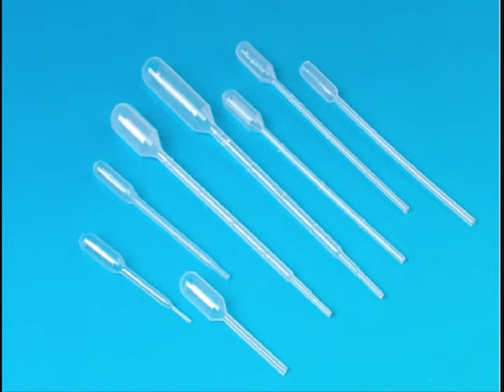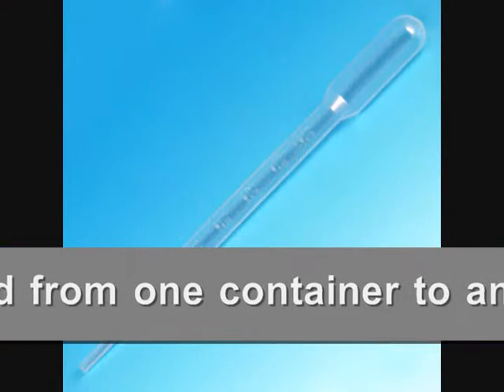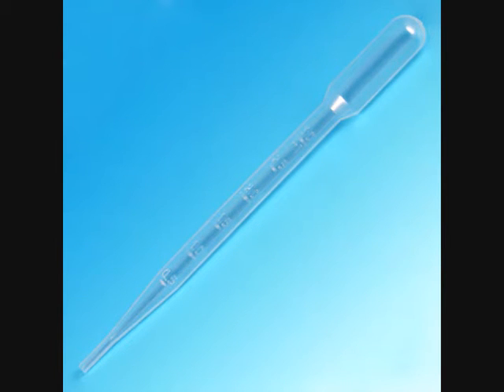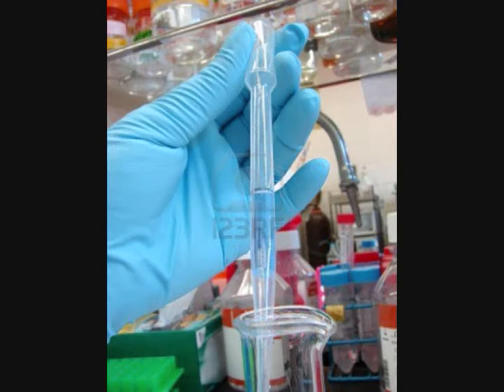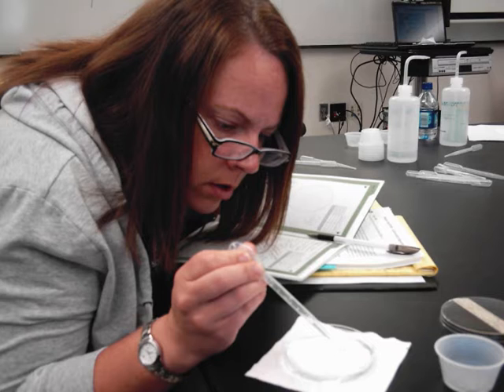Pipette. A pipette is used to move a small amount of liquid from one container to another. It has measurements on the side if you are needing to measure that fraction of a milliliter. You transfer it by squeezing the bulb at the top of the pipette, inserting the tip into the liquid that needs to be transferred, releasing the bulb at the top in order to suck in the liquid that you are needing, then transferring it to a new container, and once again squeezing the bulb at the top to transfer that liquid into the new container.